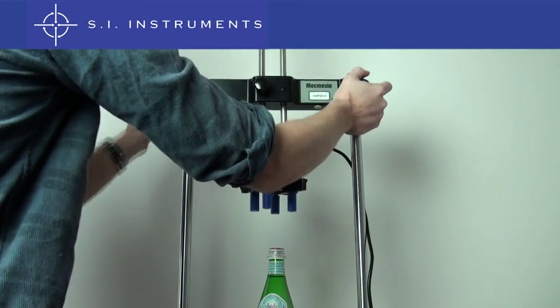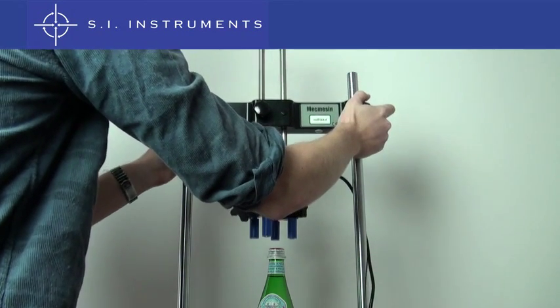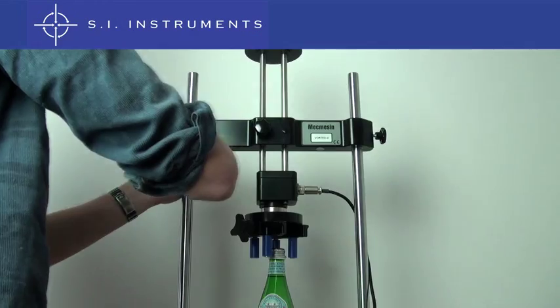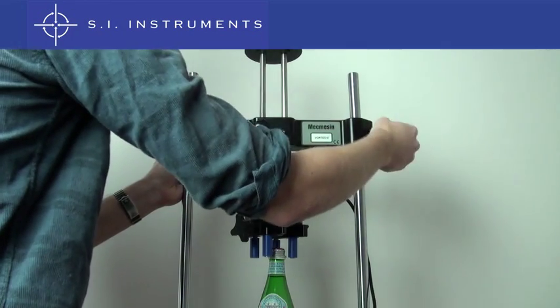The cross head can be adjusted for the different bottle heights. The centre bar is used for lowering the cap holder onto the cap of the bottle.